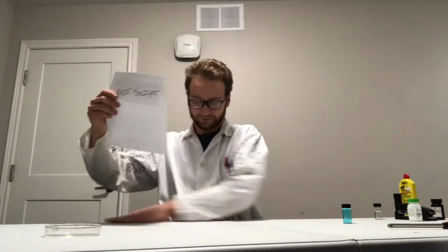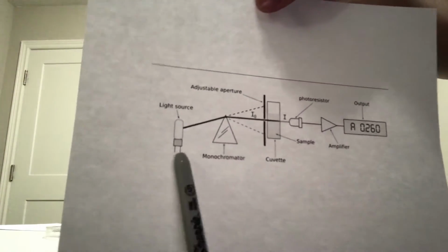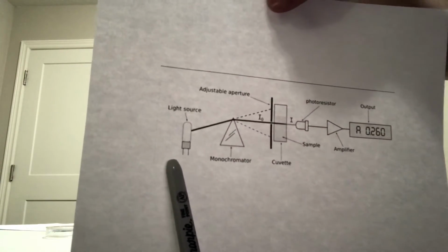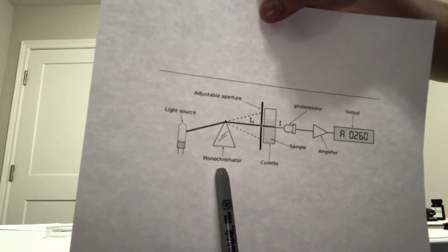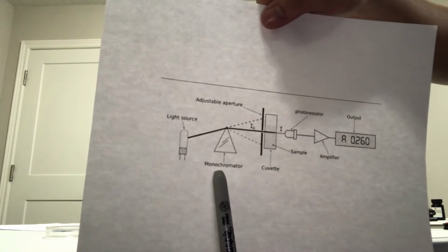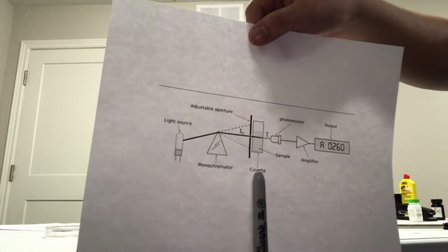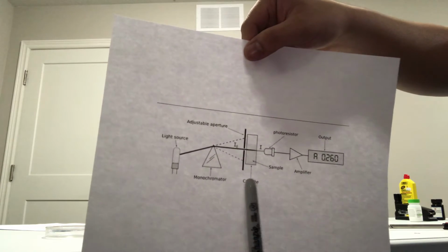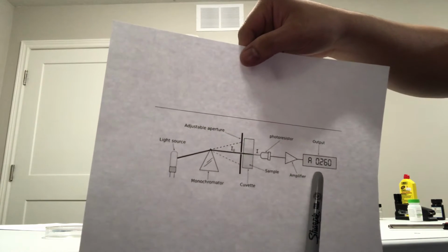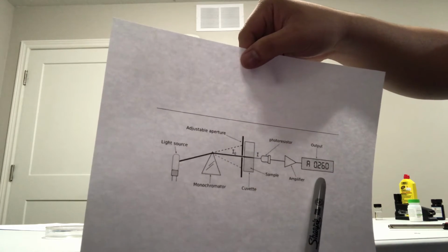Now, my assistant here is going to show you a diagram where the first component is a light source, and that's usually a lamp that generates light. The next component is a piece of equipment that selectively lets through one wavelength of light. The next component is a slit and our sample in a cuvette. And then the last component is a reader that detects the amount of light going through and the difference in intensities from before and after, and displays it on the readout.